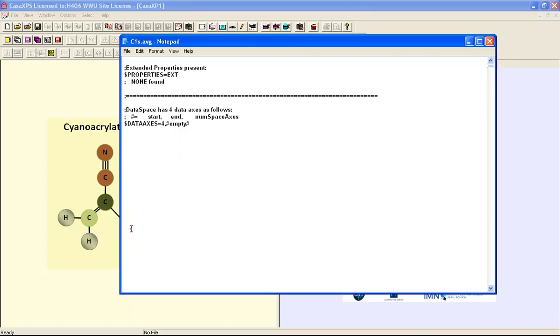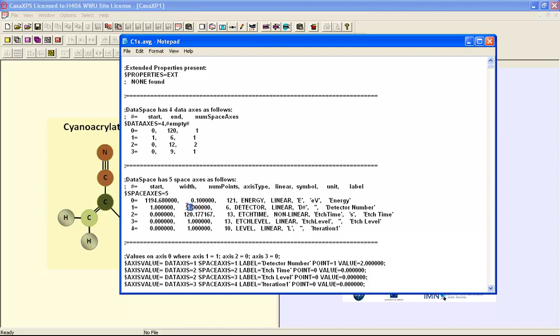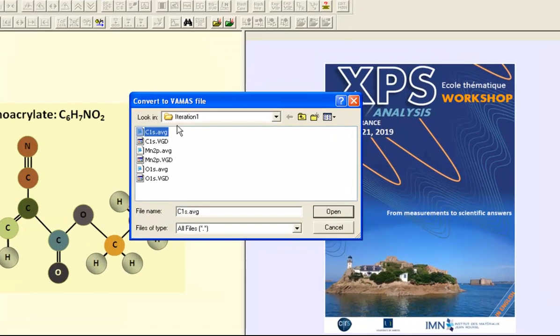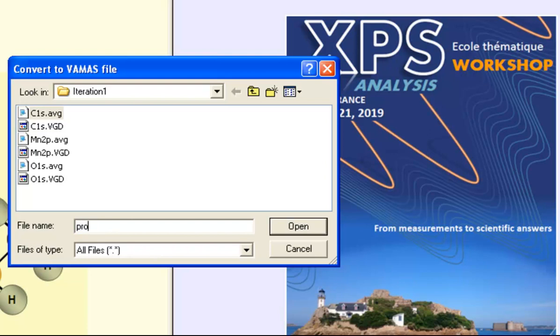However, because we have in this case iterations and we also have a splitting of data between detectors, the format requires the use of an ATH file extension when converting these data. So rather than entering a file name dot AVG, we write in this case profile iteration dot ATH.